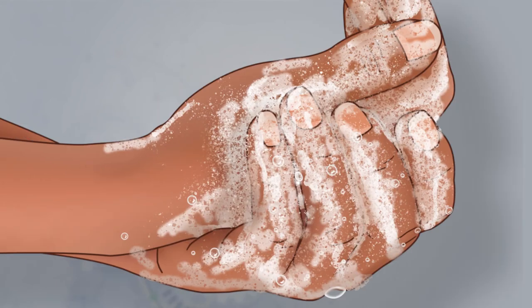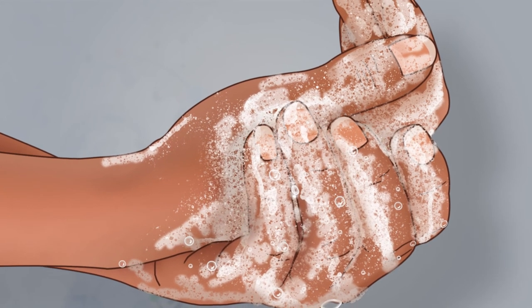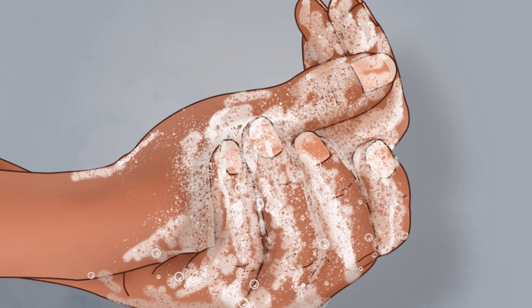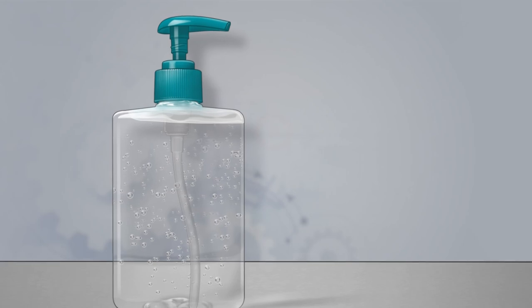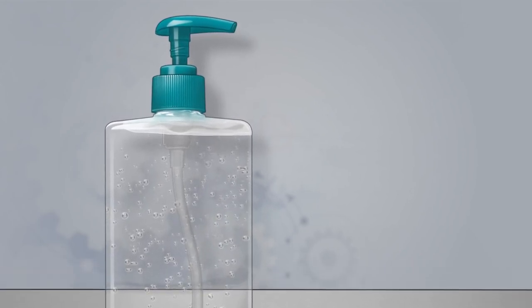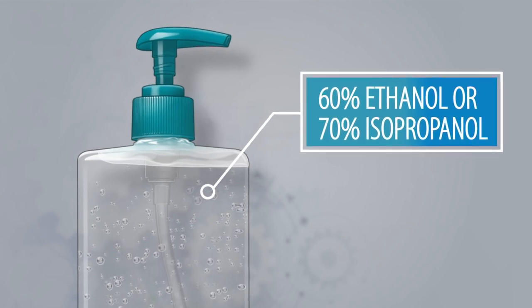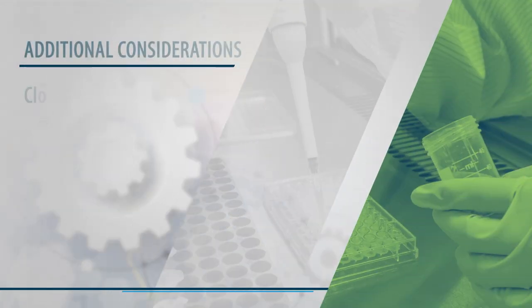Last, wash your hands with soap and water. Lather the backs of your hands, between your fingers and under your nails, and scrub for at least 20 seconds. Washing your hands with soap and water is the best method. However, if soap and water are unavailable, an alcohol-based hand sanitizer containing at least 60% ethanol or 70% isopropanol can be used as a temporary solution until soap and water are available.